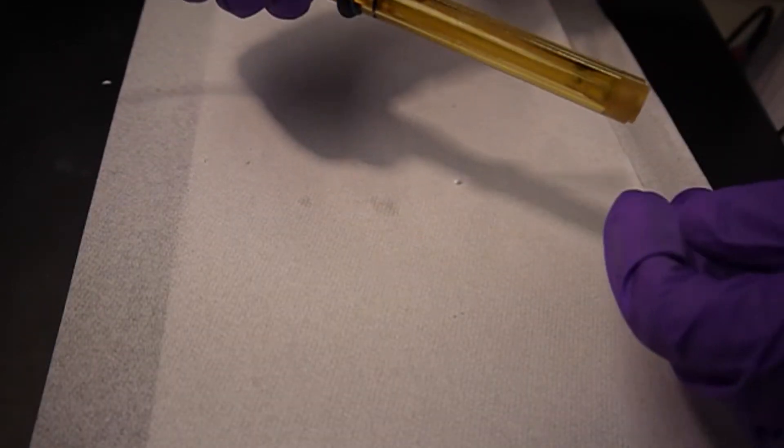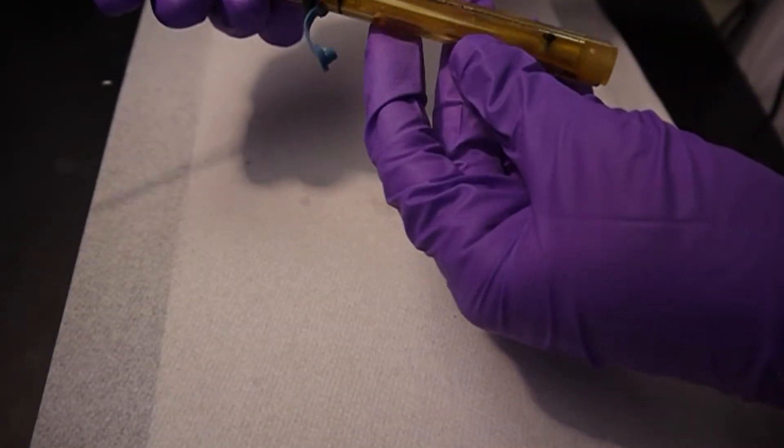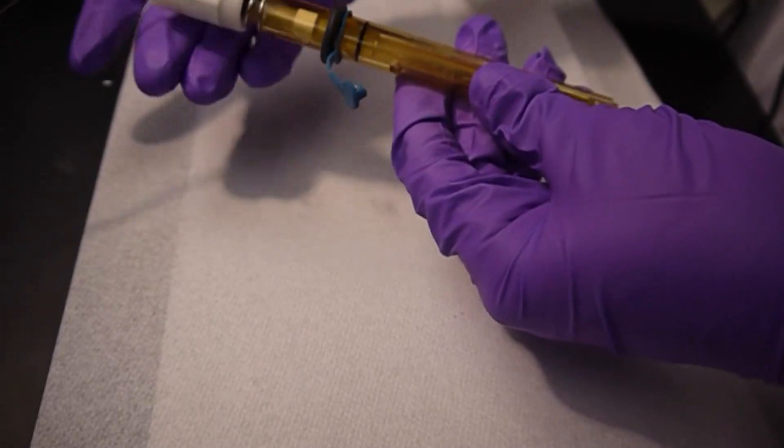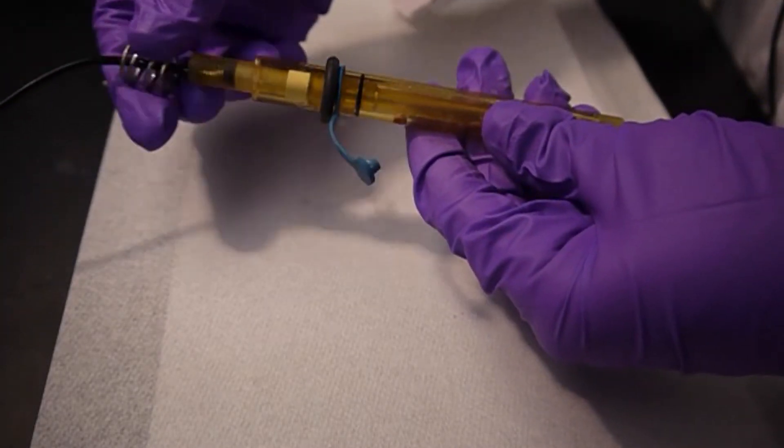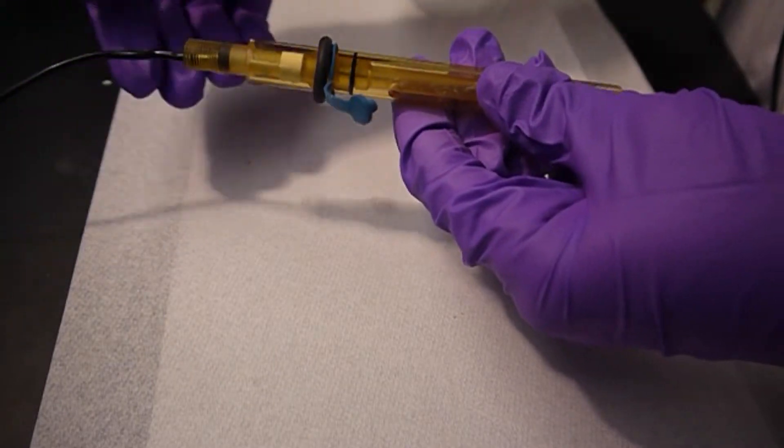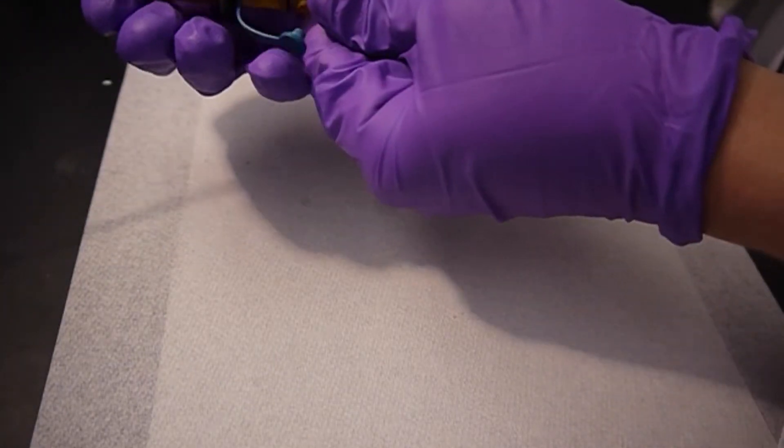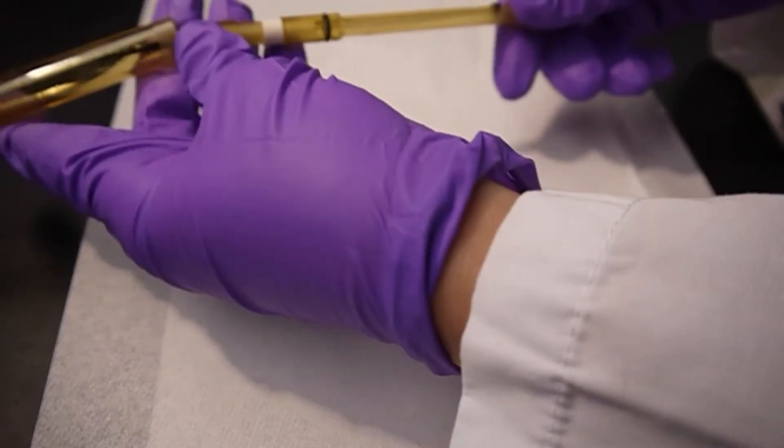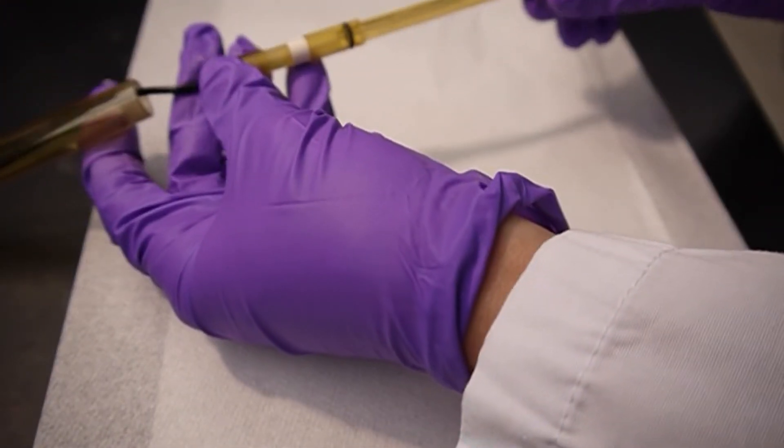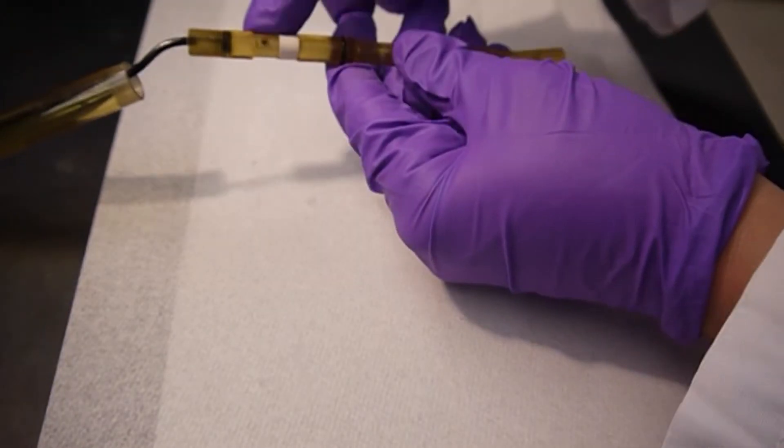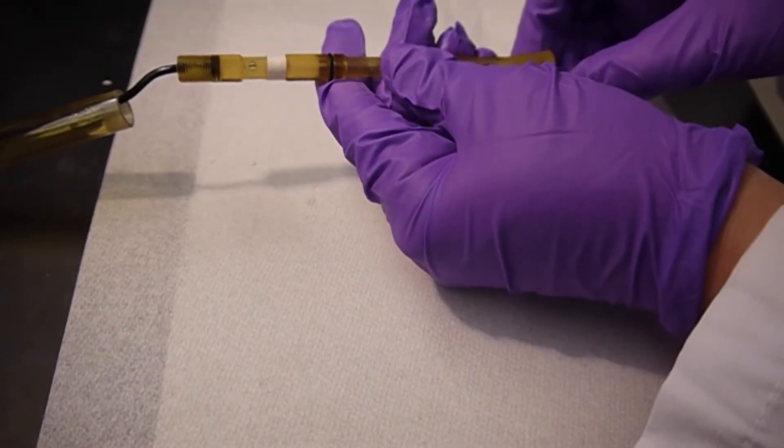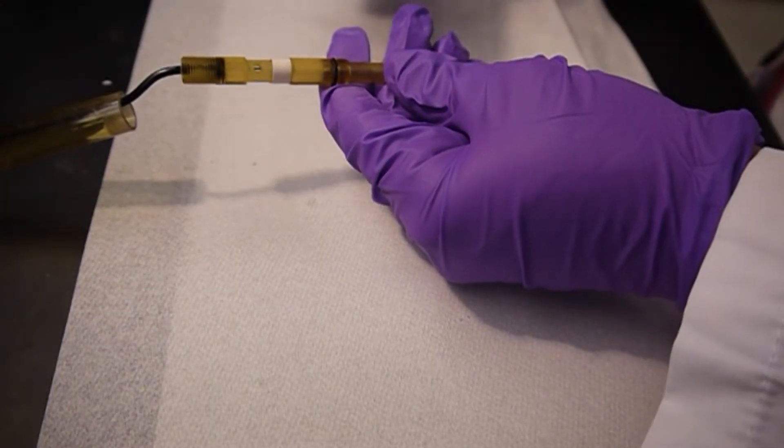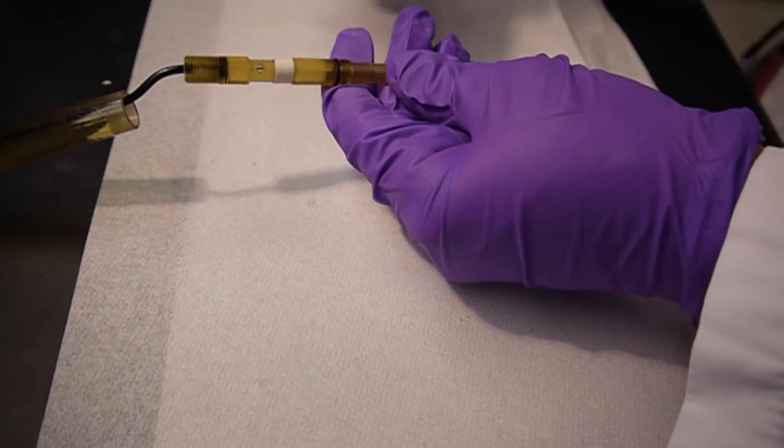Alright, so this is our reference electrode. In order to fill it, we need to take it apart. So we're going to unscrew the cap. There's a little spring here that helps hold everything in place tightly. And this inner part pushes out of the outer part. And you'll see in the inner part there's a hole here.